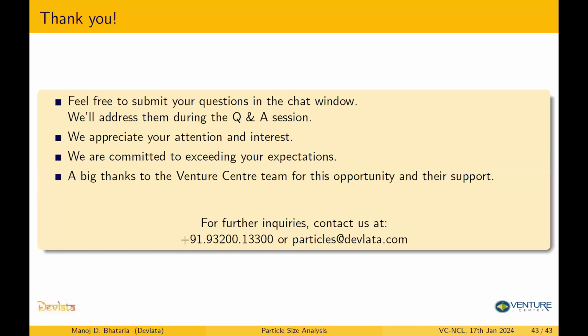Thank you. Good afternoon, sir. Sir, I have a protein sample. My subject is fluorescent protein nanoparticle. I have prepared fluorescent protein nanoparticle, and I have done DLS analysis of that many times on the same instrument, Brookhaven. Sir, there are three different angles in DLS, that is 15 degree, 90 degree, and 173 degree. If I don't know which angle should be used, then I choose the 90-degree angle.